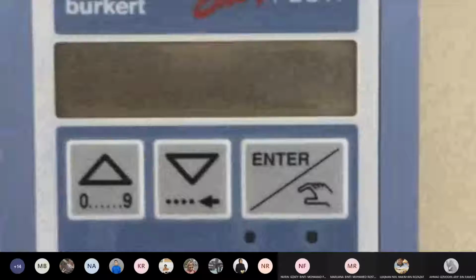Next one. Can you see F1301, F1302? I showed you earlier in the apparatus, right? These are the flow indicators. They have a sensor, a probe sensor, to measure the flow rate, which should be the volumetric flow rate. So why are there two flow indicators? One is for sodium hydroxide, one is for ethyl acetate. This is the flow sensor.